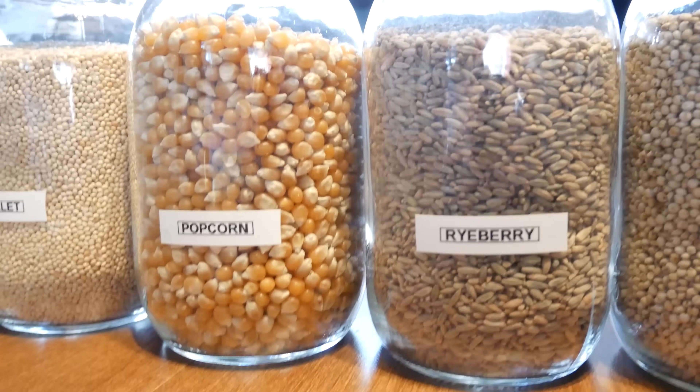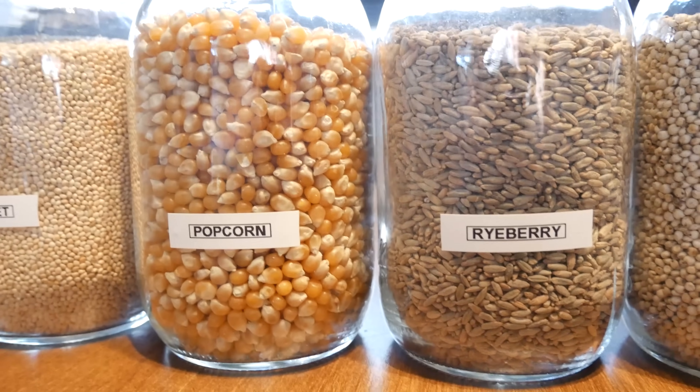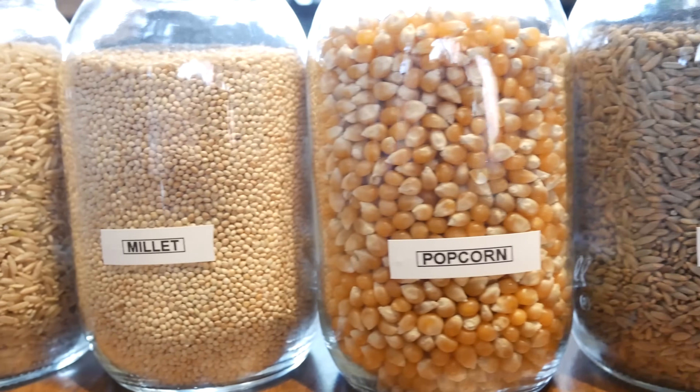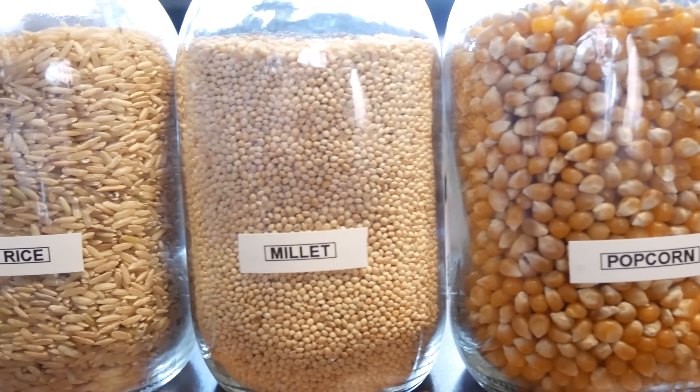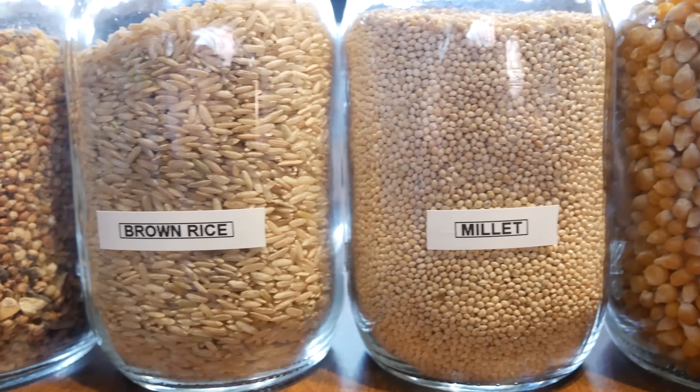The goal of this experiment is to find out what effect the grains have on mycelium during colonization, which one is going to colonize the fastest, what effect the grains would have when it comes to fruiting, and what's the best overall grain you should be using. Stay tuned until the end to find out.